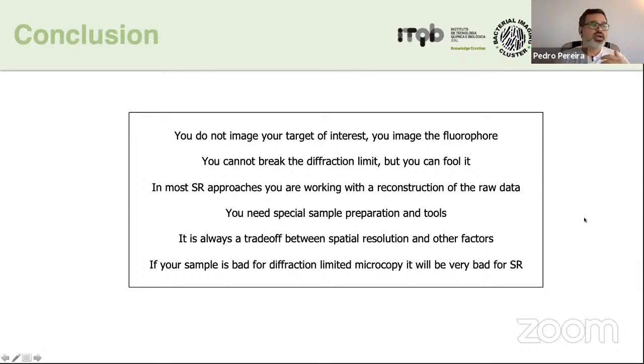So one thing you should be aware of is these pieces of advice here, and that it's not as easy as getting your normal sample preparation from a confocal or a diffraction limited wide field and then going to a super resolution microscope. It does not work like that. You have to be aware of what you're doing, okay? They said it's easy. It's not rocket science.